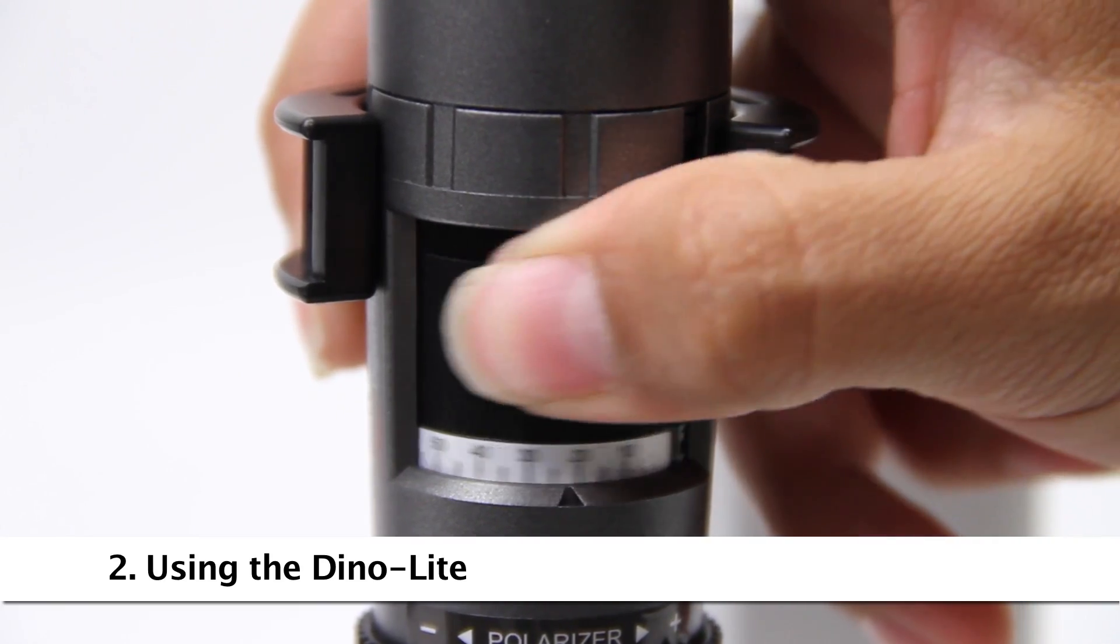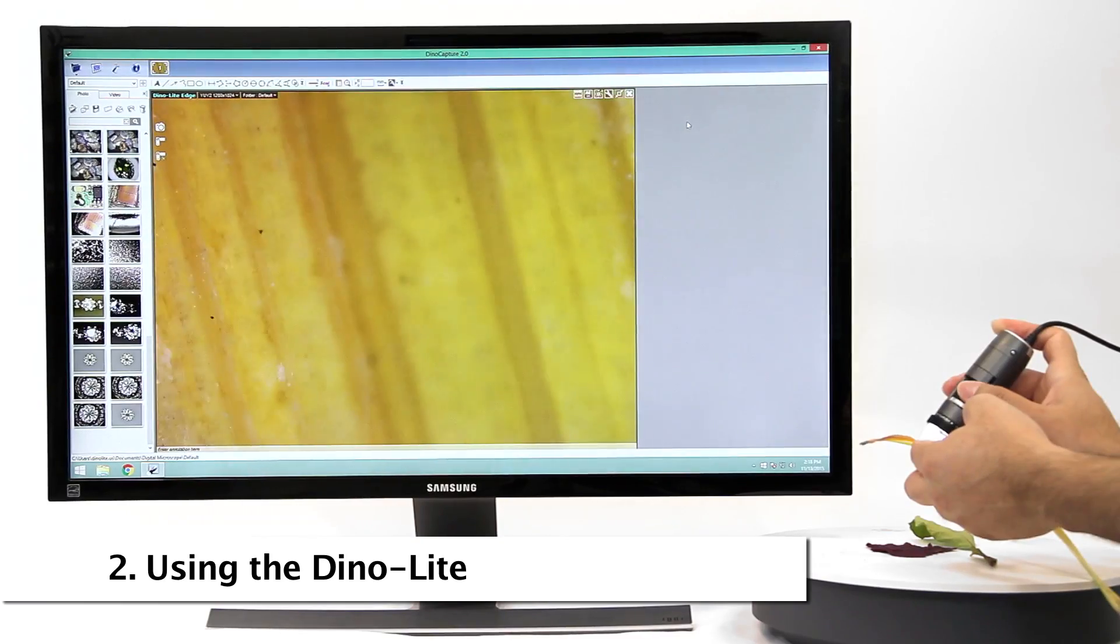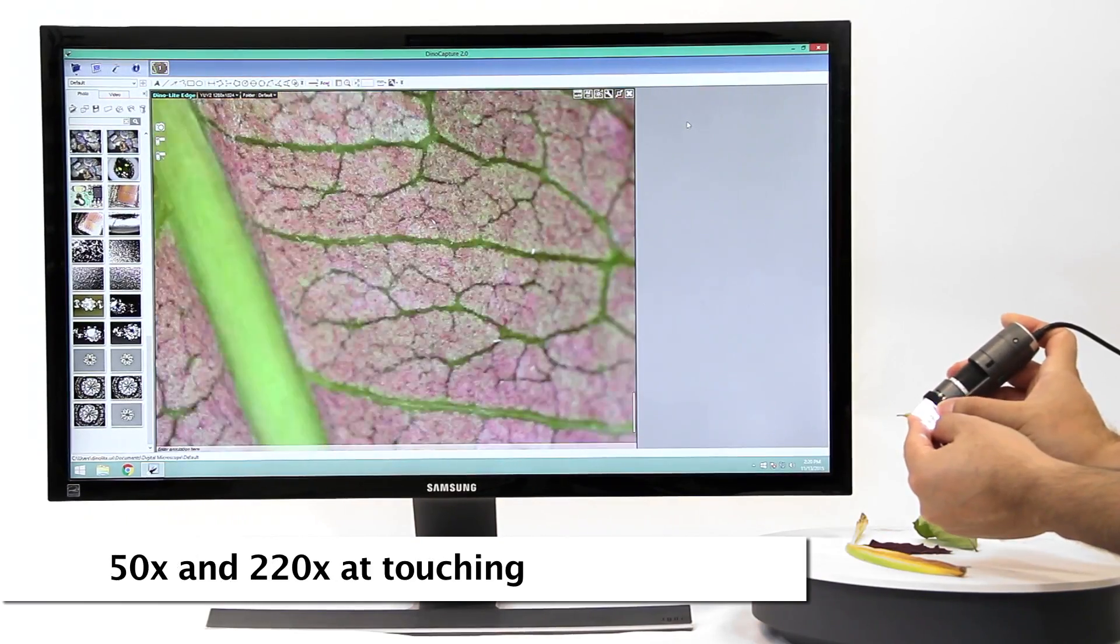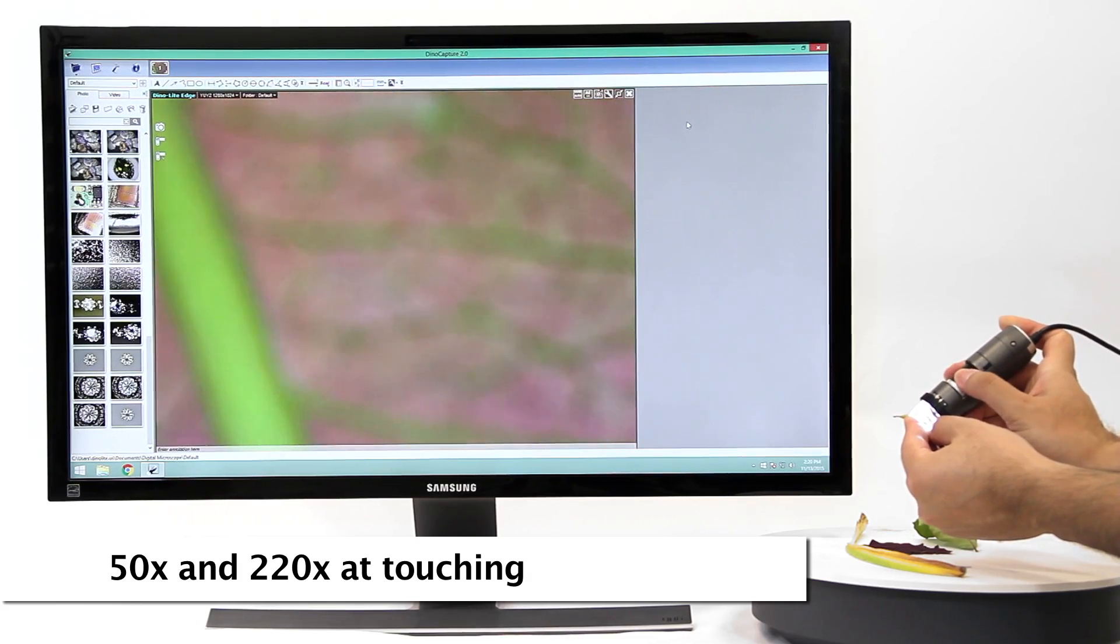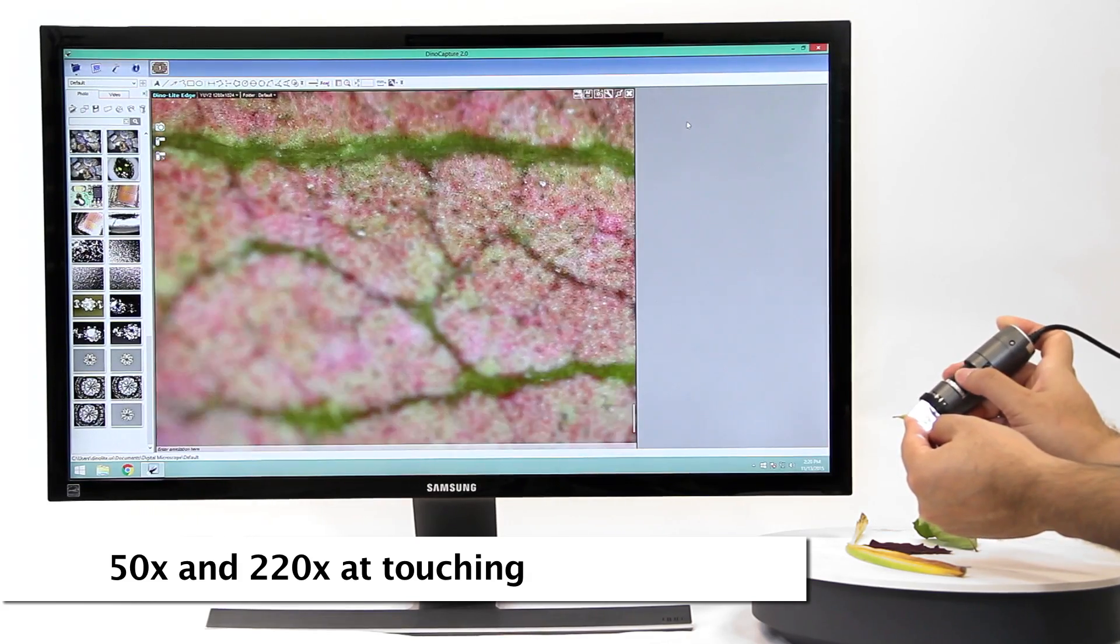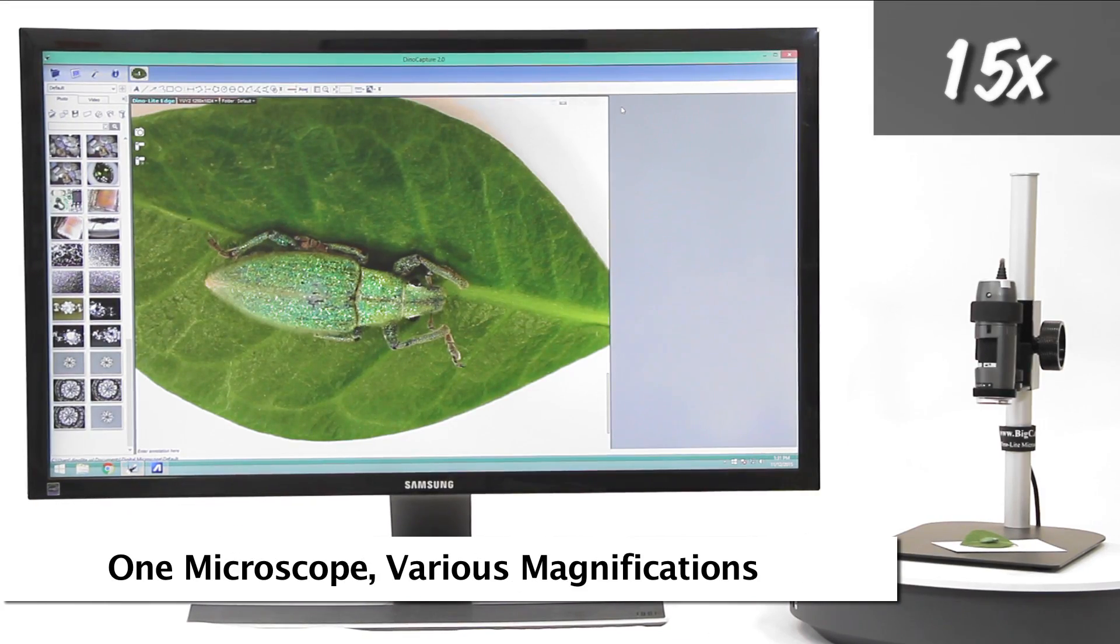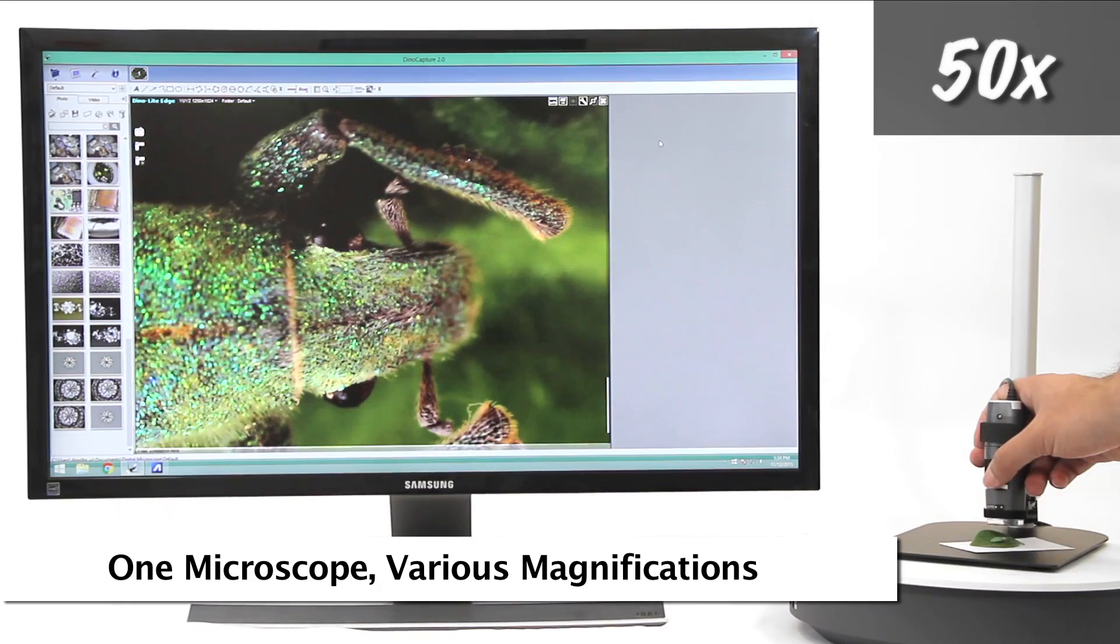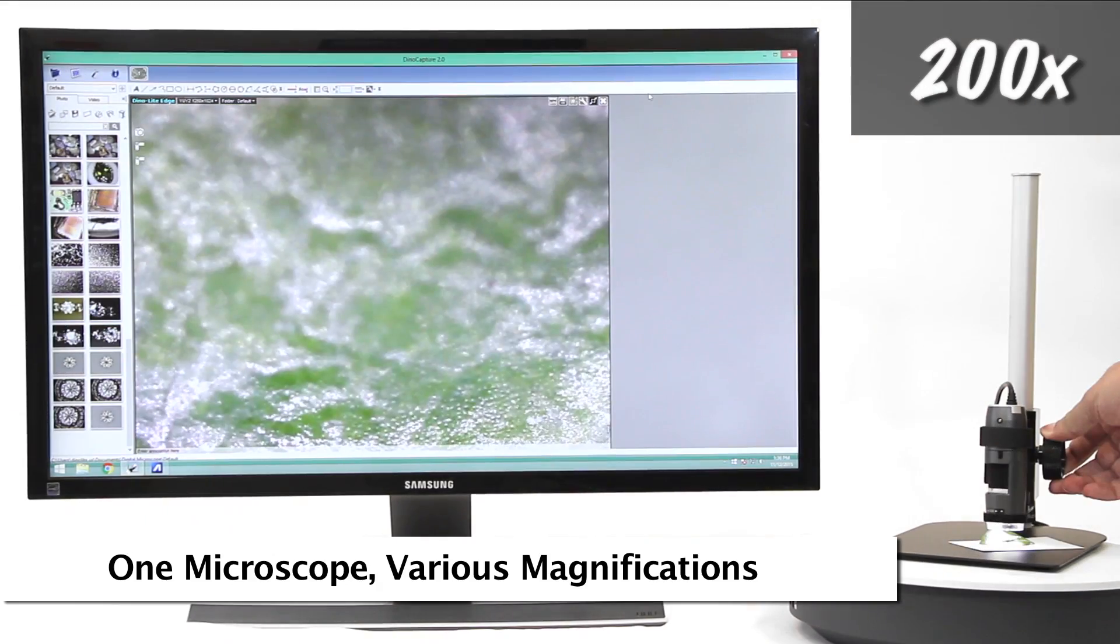Standard Dynolite working distance allows for 50 times and 220 times magnification when the end of the Dynolite nozzle is in contact with the object being viewed. This is an example of the standard working distance and corresponding magnifications as well as the results.